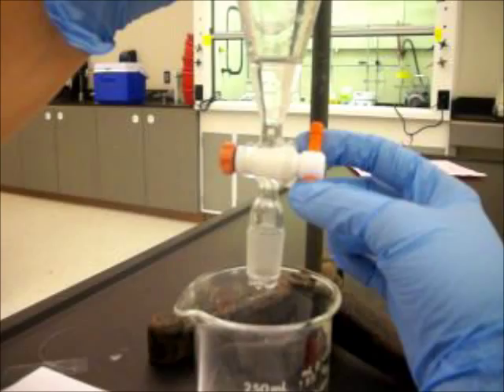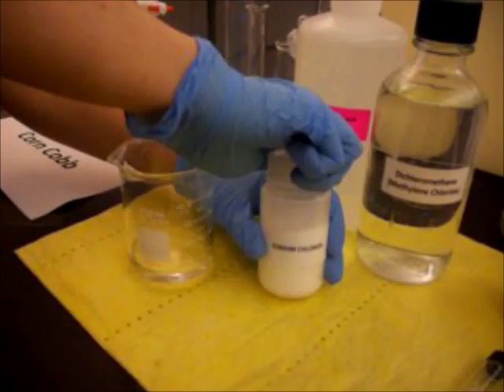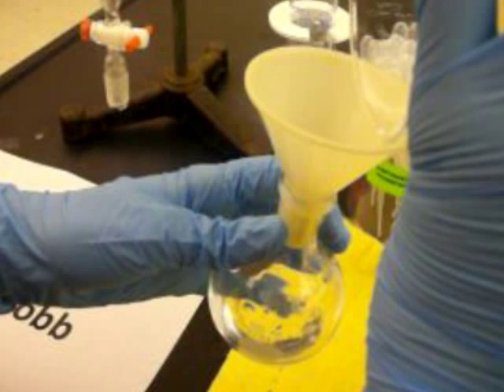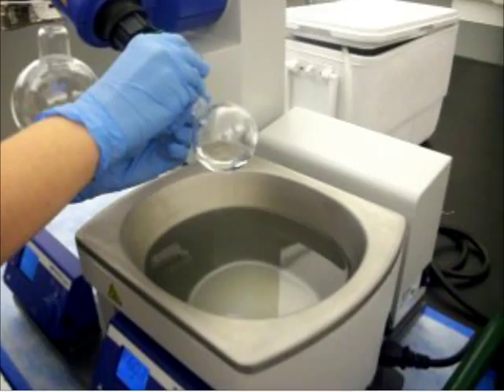Add a small amount of anhydrous sodium sulfate to the beaker to remove any remaining water. Transfer your distillate to a clean 100 ml round bottom flask and rotovap off the dichloromethane.